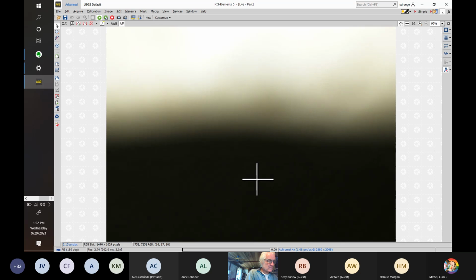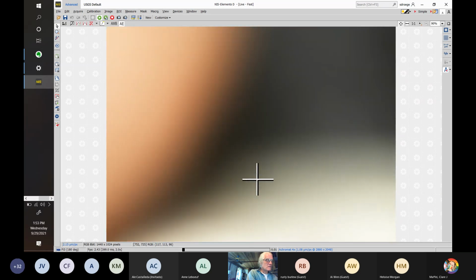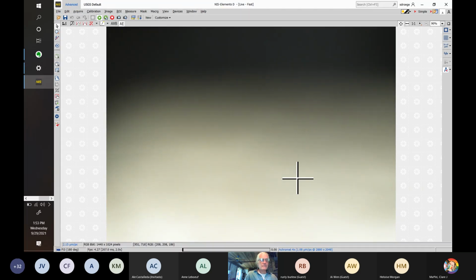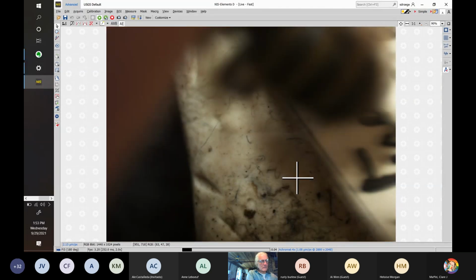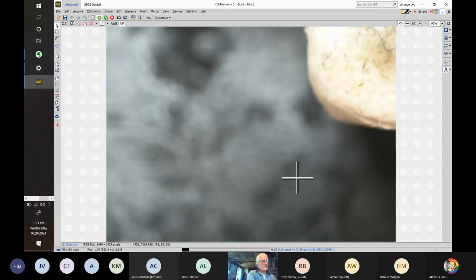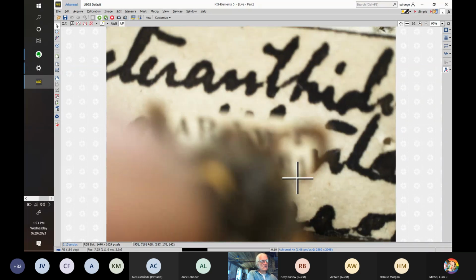I've got some really old specimens that are potentially like 100 years old, and some are saying this is Heteranthidium, which I believe is a subgenus of, oh, this says Boulder, Colorado. Interesting. A subgenus of Trachusa. So we're going to use this as an example. Look it up. Oh, this is Heteranthidium occidentale, and that's Cresson's name, so that's quite old.